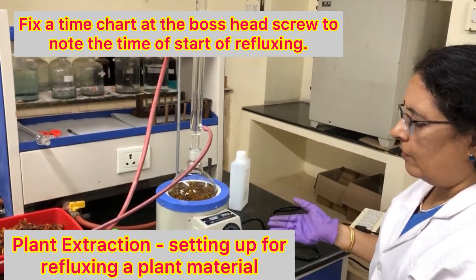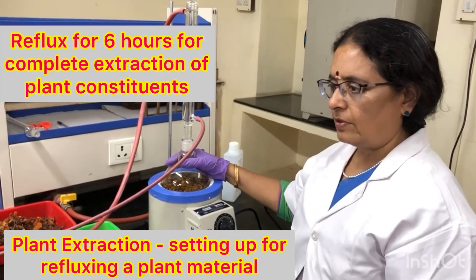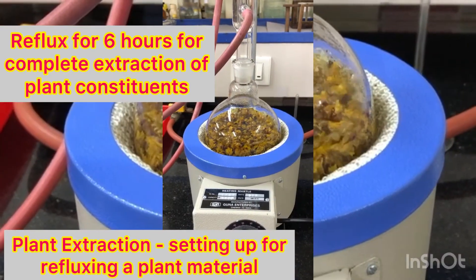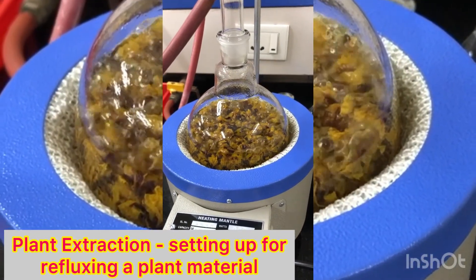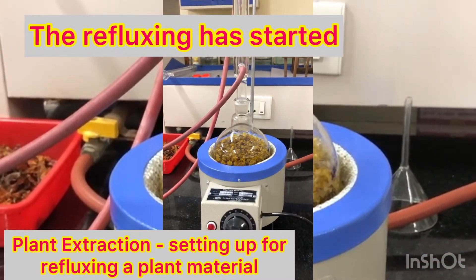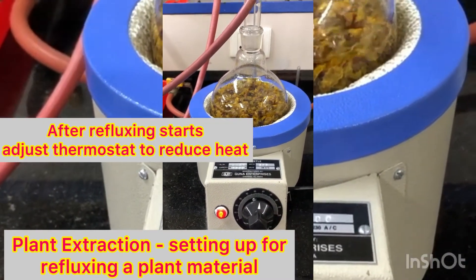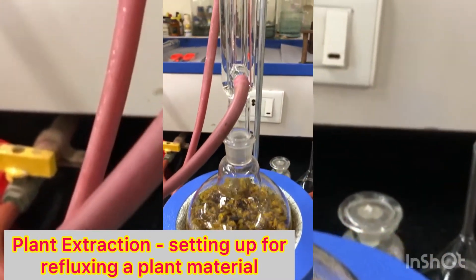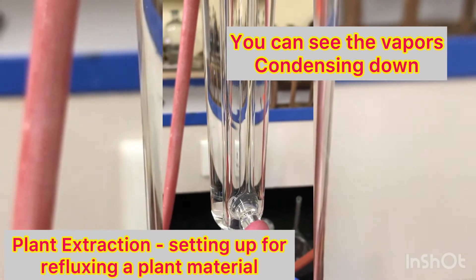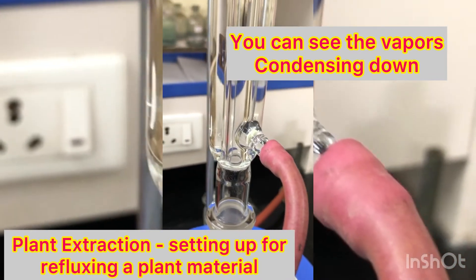You can make a small chart paper, place it here, and note the time and date of starting. For all plant extracts, we need to boil for six hours for complete extraction of the phyto constituents. This is how you set up for a refluxing process — you can see the refluxing has started and the vapors are condensing down.